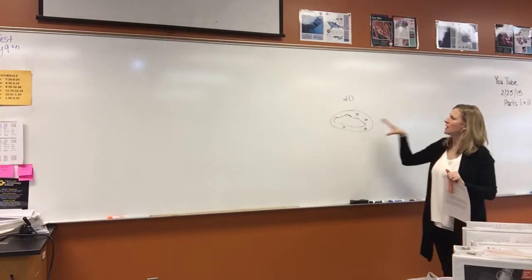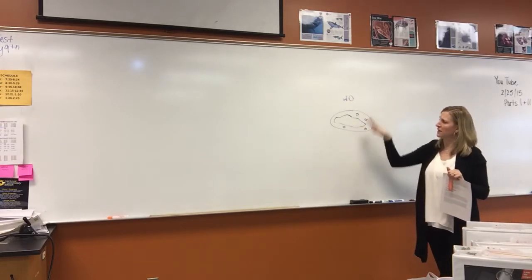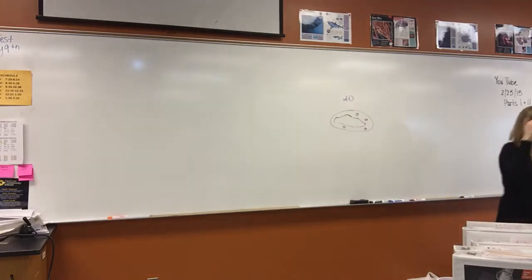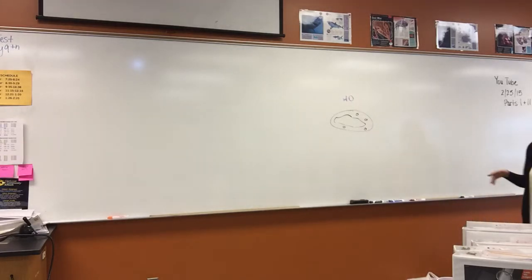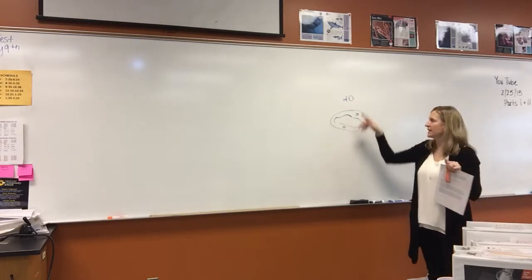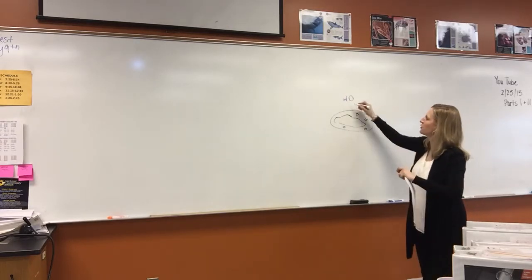So then, we can't see bacteria, but we can make a clear solution with bacteria in it and put these recombinant plasmids and mix it in the environment. And what will this bacteria do? It will take it in. Bacteria naturally take in foreign DNA.